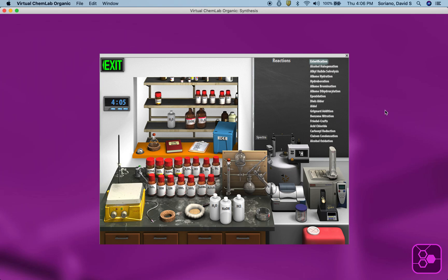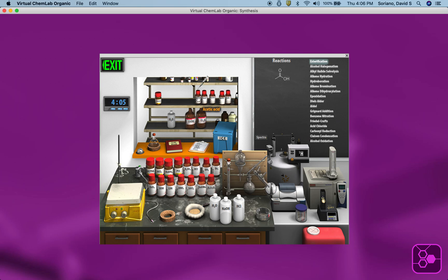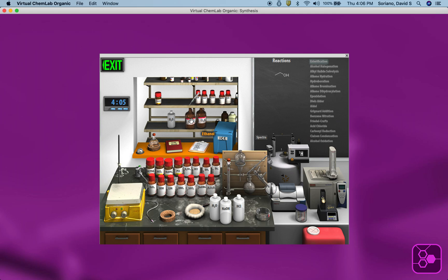Here's a typical lab bench. We'll do an esterification, and these are the various carboxylic acids and alcohols available. You can use a syringe to add to the round bottom flask. I'll use that one time to show you. I'm going to add acetic acid. You see the color in the round bottom flask? It's actually much easier on the eye — at least with my Mac — to double click. I'm going to add alcohol, ethyl alcohol. That's been added. I'll bring the round bottom now. See the two reagents up on the blackboard? Acetic acid and ethyl alcohol — standard esterification.